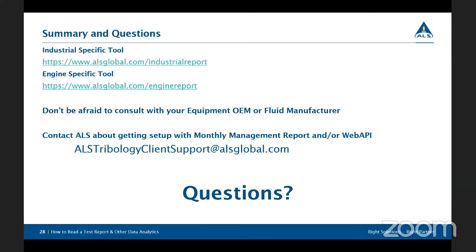To do a few reports, I can type in a few various codes that have designated phrases based on what I'm interpreting from it. And we have hundreds and hundreds of different codes and scenarios that apply to everything. That's why on your end, it might feel that there's a standard reply. But if there's a name at the bottom left of an analyst, that means that somebody did look at that report. They reviewed everything. And even though everything might be normal, they're the ones that hand typed out those comments.